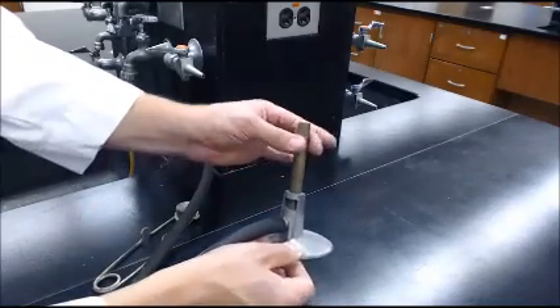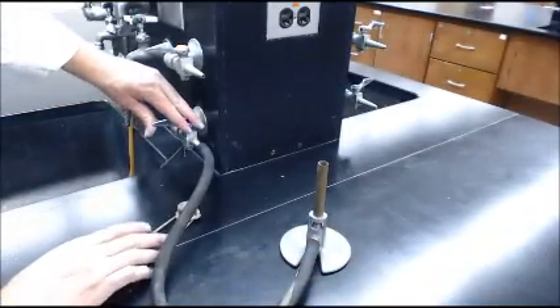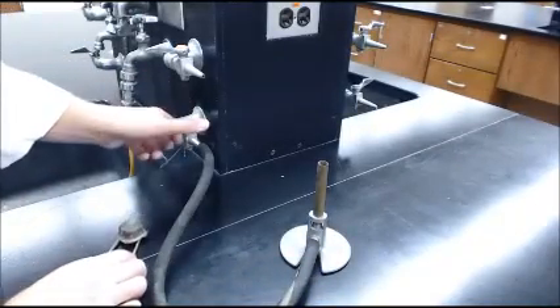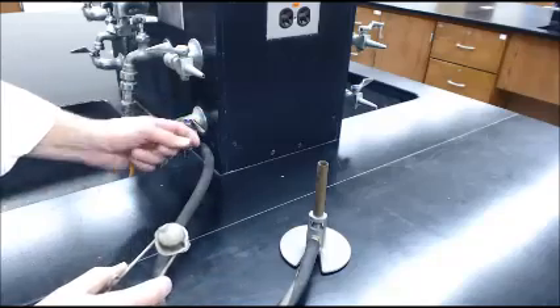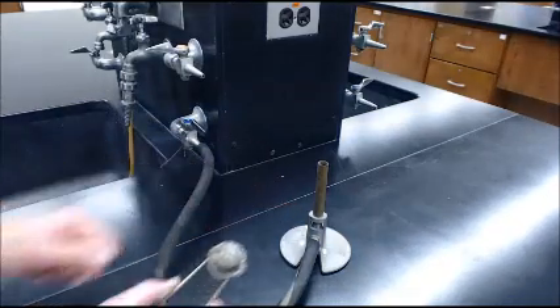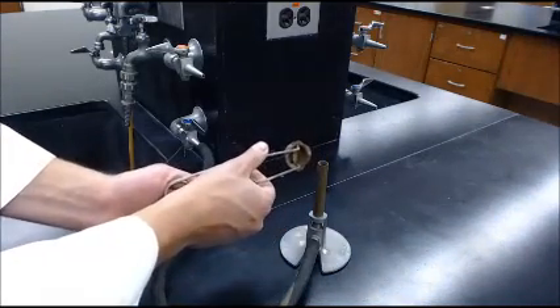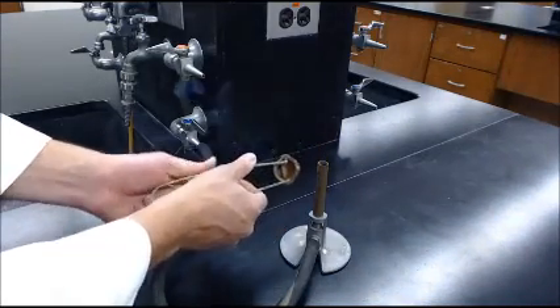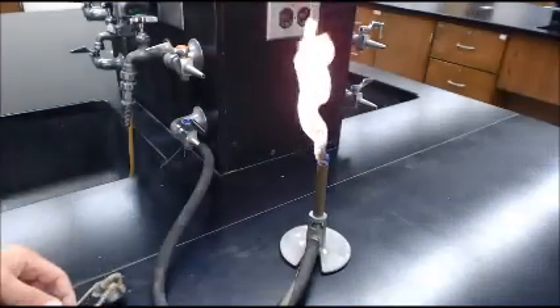It's best to get it started with it all the way closed. You can go ahead and open it all the way, or you can control the amount of gas by the valve right here. Other Bunsen burners have it on here — we do not. Come in from the side and using your striker, create a spark and you can see a nice big flame.